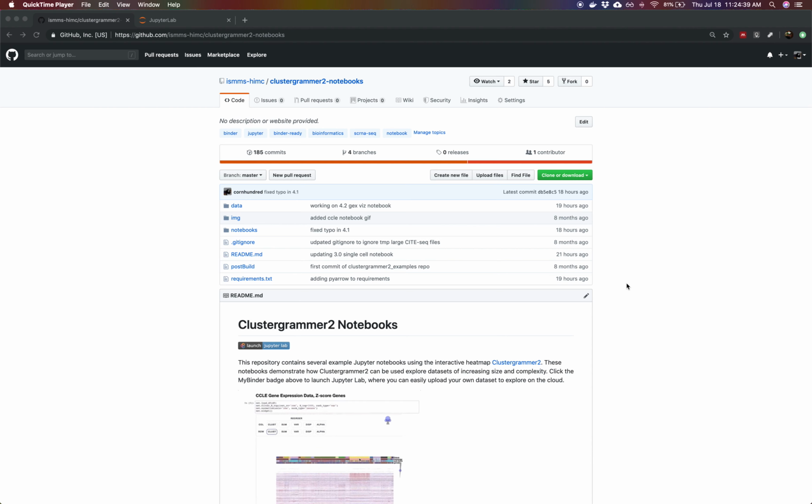Hello, I'm Nicholas Fernandez. I'm a computational scientist at the Human Immune Monitoring Center at Icahn School of Medicine at Mount Sinai. And this video tutorial is going to walk you through a short notebook visualizing some CITE-seq data that is made publicly available by 10x Genomics.